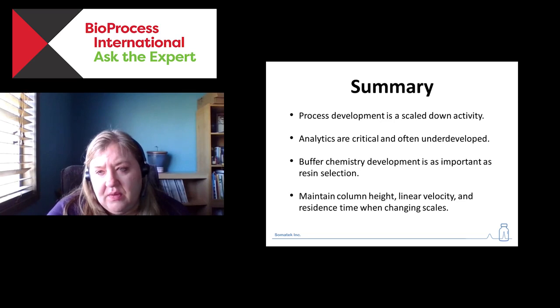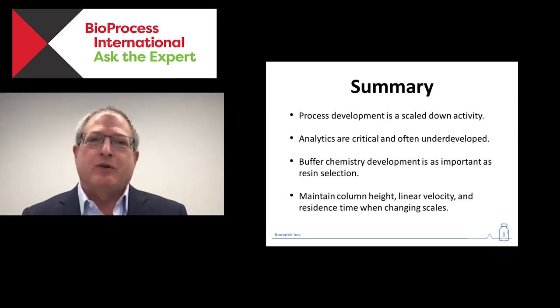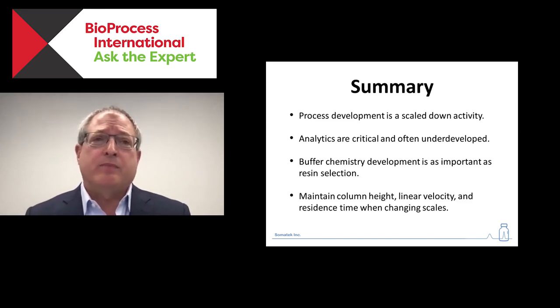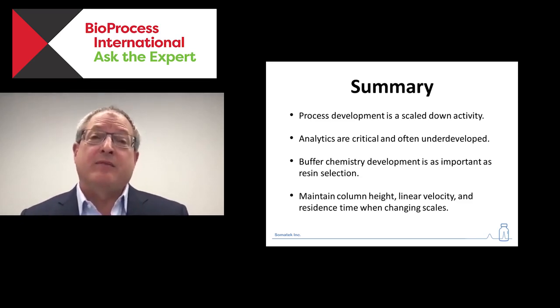Yes. All is a little bit of an extreme term, but we generally show that we remove it to the point where it's not detectable. And usually, whether your nuclease is Benzonase or Denarase, it very rarely, from my experience, co-elutes with your product. In fact, I've never seen it co-elute with the product. However, yes, we do test it, and it's one of our release tests for all of the times we use it.